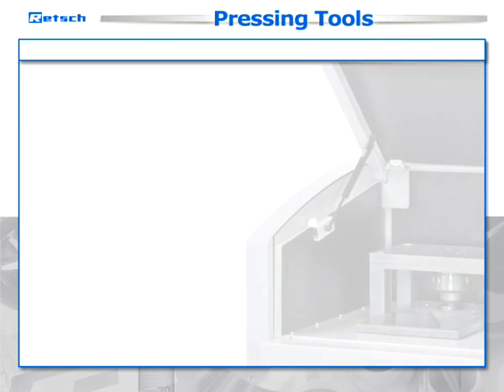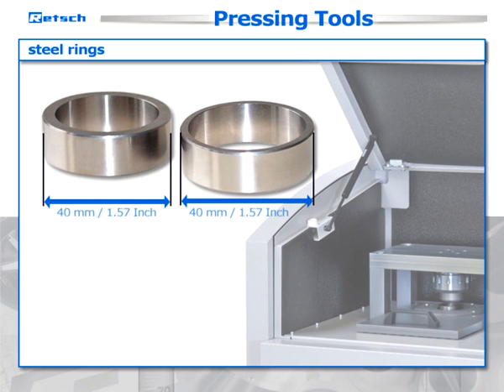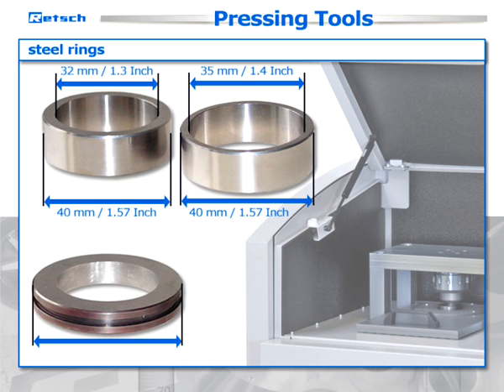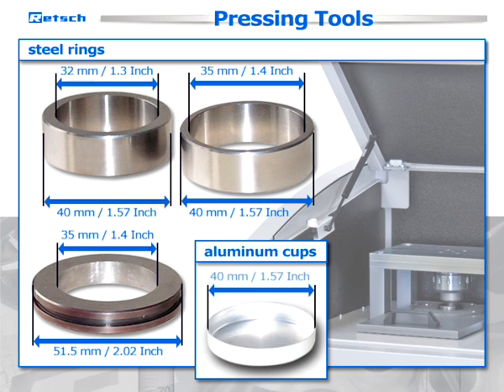Pressing tools are available in four different versions: steel rings with an outer diameter of 40 millimeters and inner diameters of 32 and 35 millimeters; a steel ring with an outer diameter of 51.5 millimeters and inner diameter of 35 millimeters for working with higher pressures. In addition, we offer aluminum cups with a diameter of 40 millimeters for pressing samples which do not form a stable pellet. The cup helps to stabilize the sample and enhances the versatile application possibilities of the PP40.